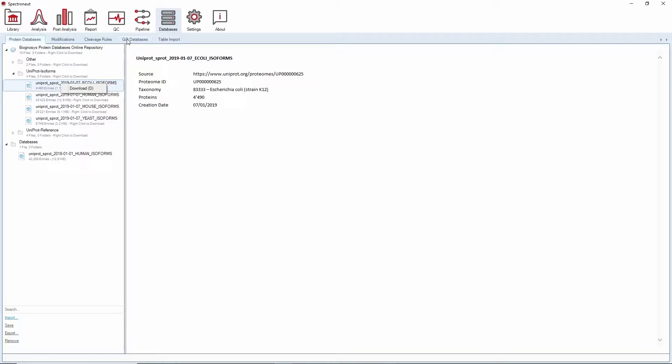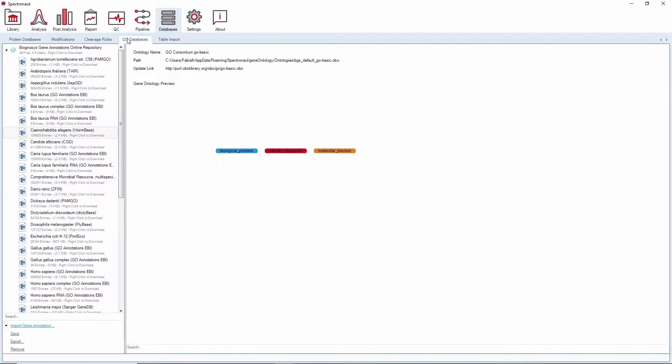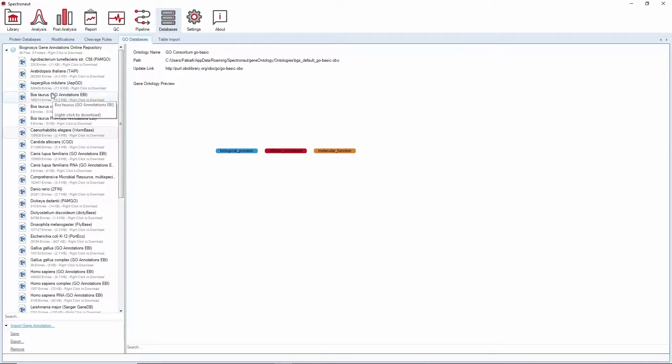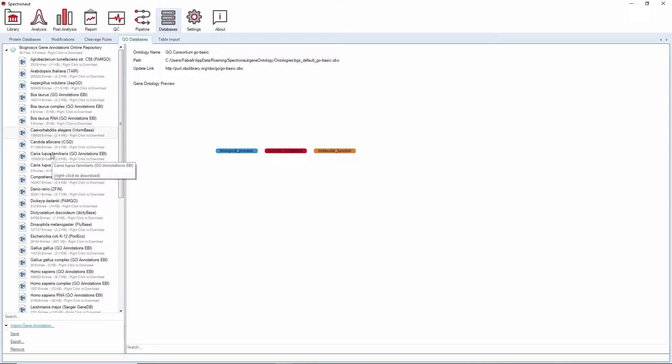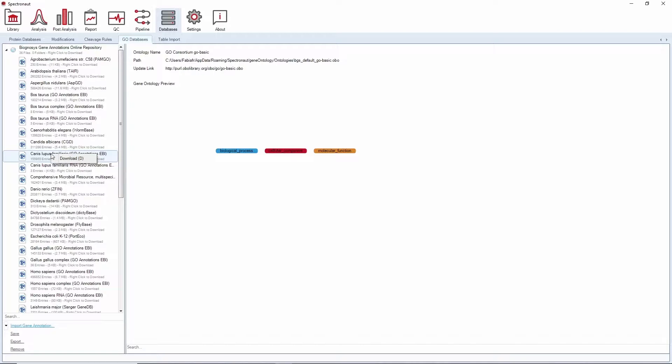You can do the same in the Geneontology databases, where we set available gene annotation files for several organisms. If you choose an annotation file for your analysis, make sure that the gene annotation matches the FASTA identifiers.